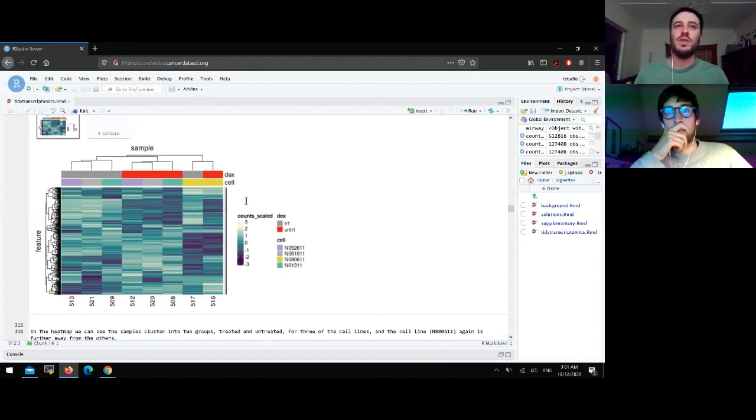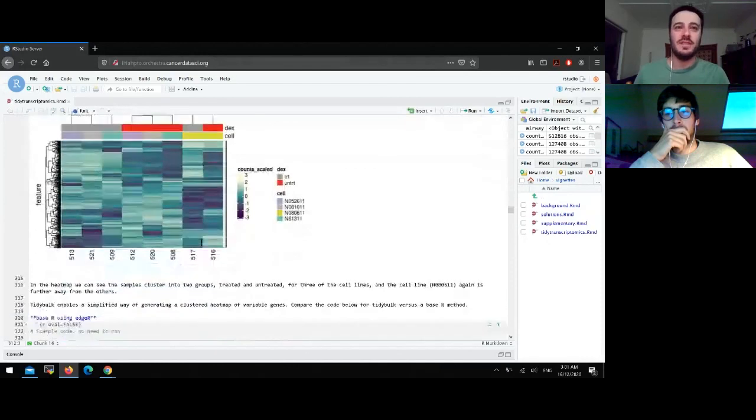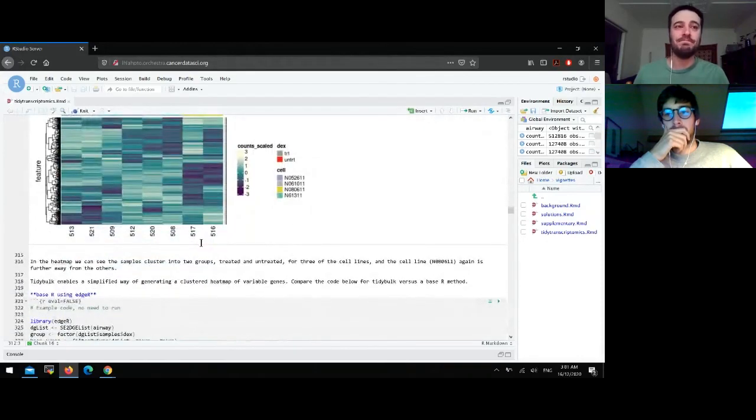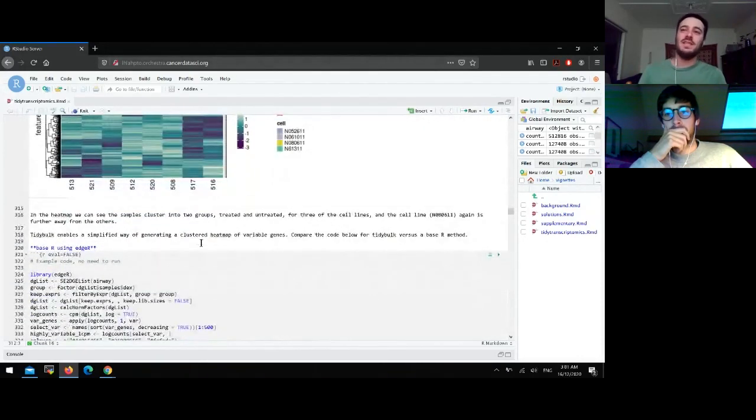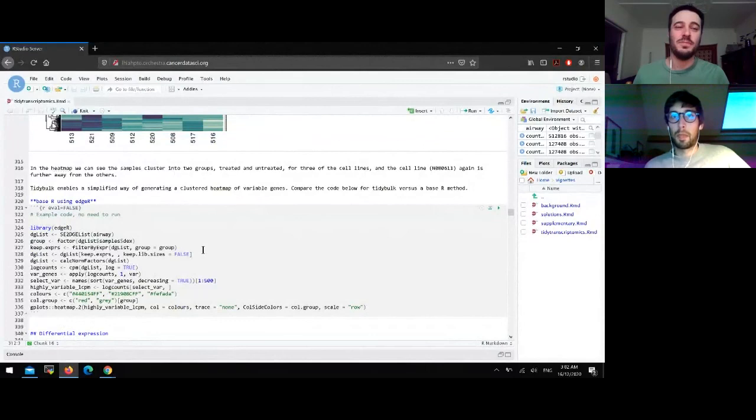And if we wanted, we could get deeper into which genes are preferentially transcribed in one cluster versus the other for deeper interpretation. But this is just to show you an example of how to produce an annotated heat map in a tidy fashion. And so as you can see here, we are integrating tidyBulk and tidyverse functions quite effortlessly. And this trend will continue for the rest of the workshop.